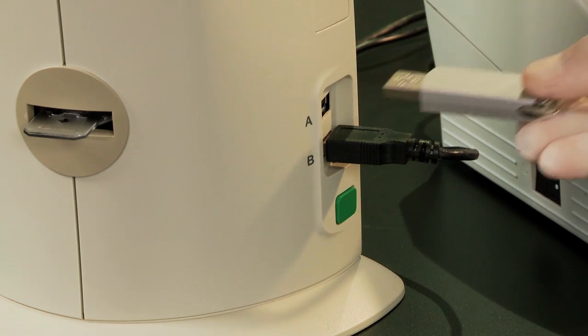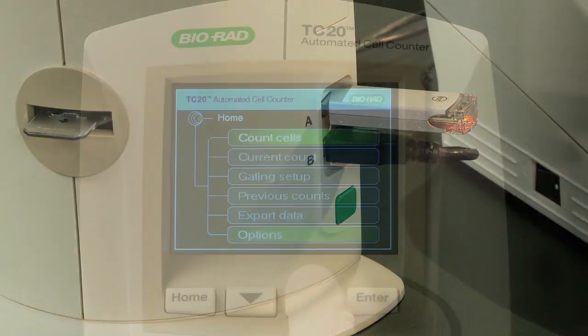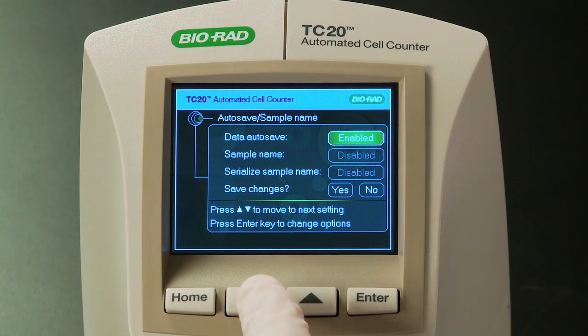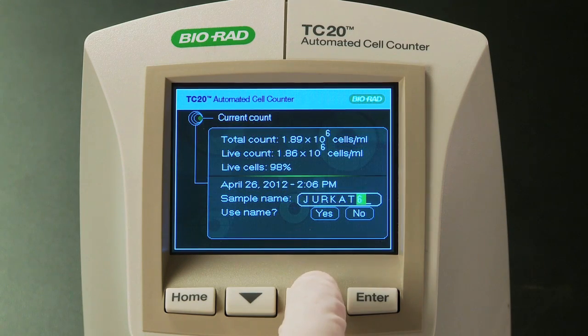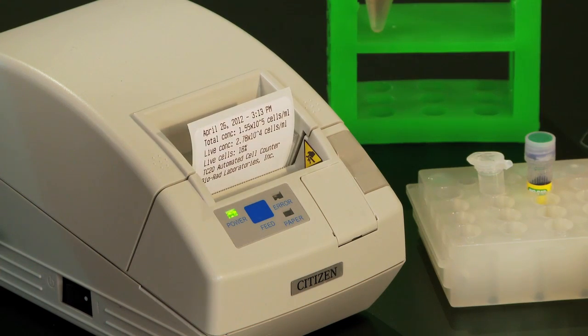When done, you can export the cell count results as well as the cell image to a USB flash drive. You can also set up the TC20 to automatically export cell images with cell count information to a USB flash drive. For easier sample traceability, you can name your samples with custom sample names. You can also print your results using a thermal printer directly from the instrument.